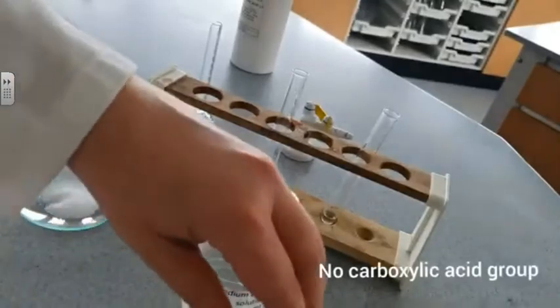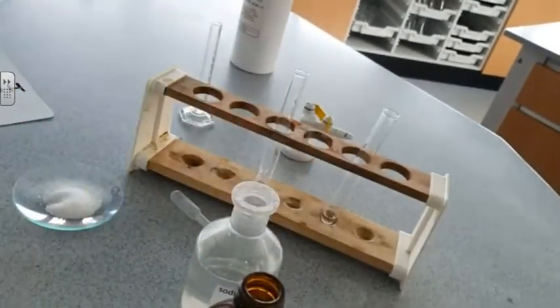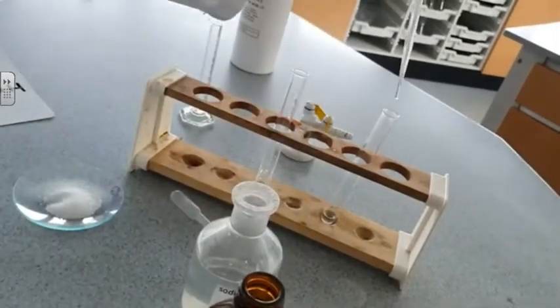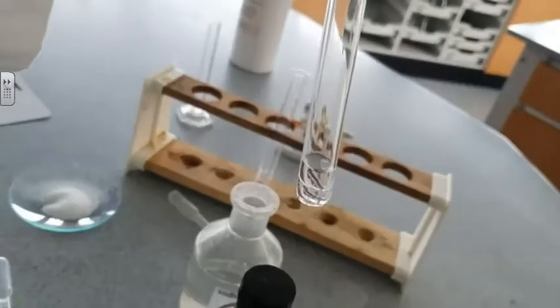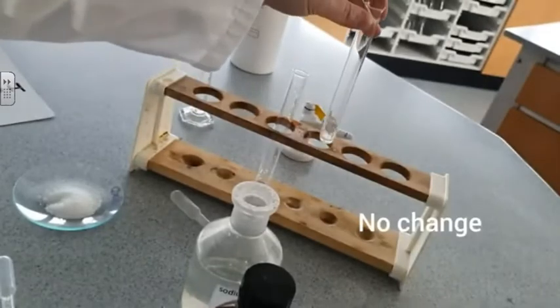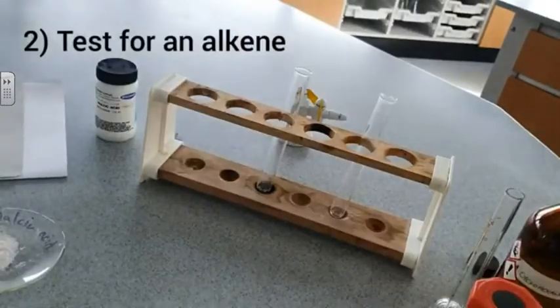Cyclohexane has no carboxylic acid groups, and so should not effervesce with sodium carbonate. There we go, you can see now there's no observable reaction, no observable change in that test tube. There is no carboxylic acid group.